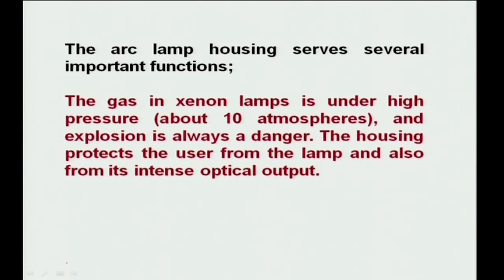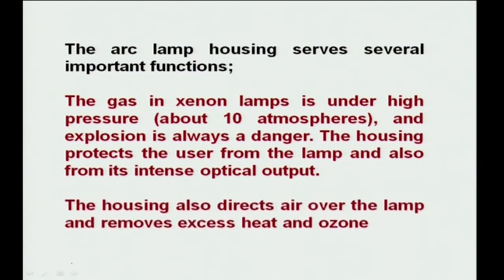Well, these are the functions of the arc lamp, as I just said. I will just complete it. The gas in xenon lamps is under high pressure, about 10 atmospheres, and explosion is always a danger. The housing protects the user from the lamp and also from its intense optical output. The housing also directs air over the lamp and removes excess heat and ozone.